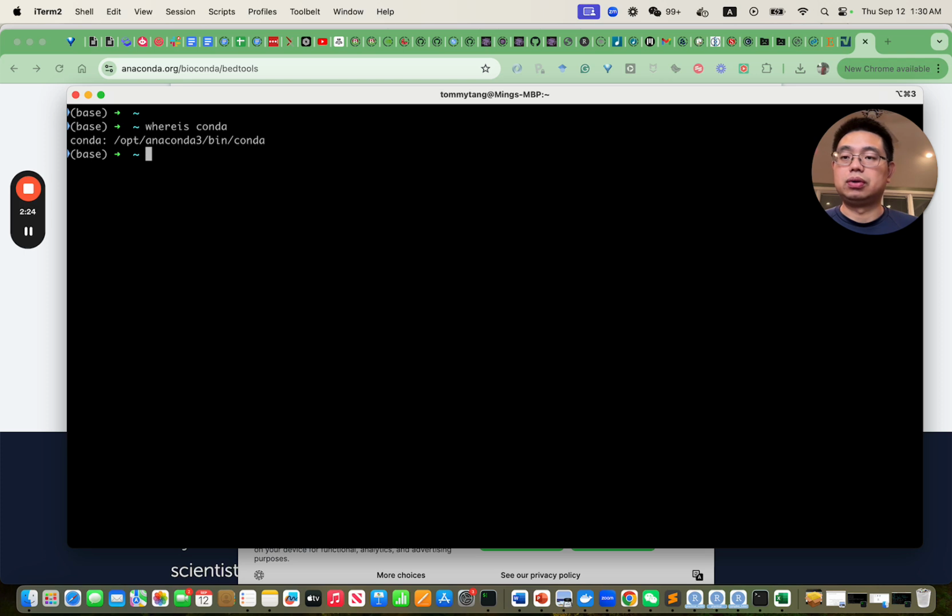So we will do conda create. -n is the name of the environment. You can name it anything you want. For example, I will use chip-seq analysis, and then the names of the tools that you want to install: Bedtools. You can install multiple tools and separate them by space, but in this case I only have one, and I will specify the channel to be BioConda. Let's see how it looks.